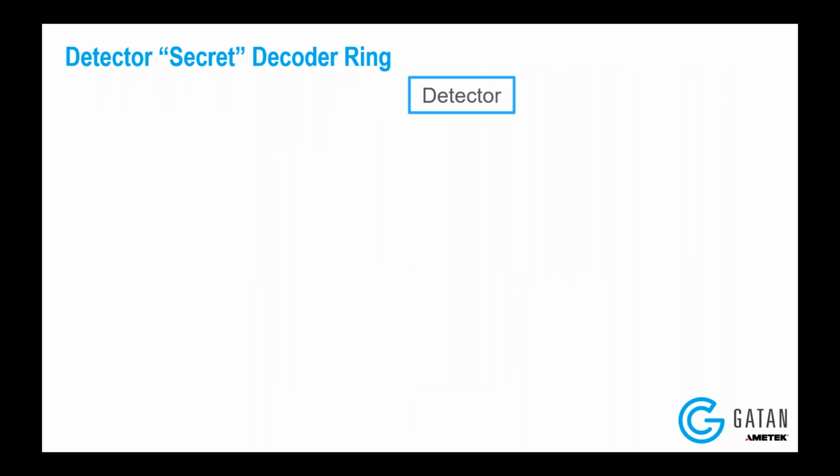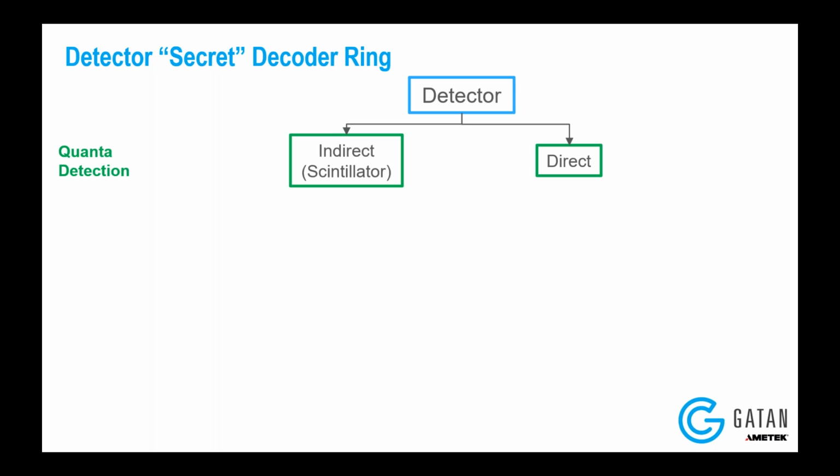But as I already just walked us through the Gatan imaging portfolio, I think there's a lot of terms that we use for describing the different cameras that many people may not be familiar with. So I thought it'd be useful to walk through all the different ways that we can describe a camera and how the design attributes of a camera that you use for electron microscopy can impact its suitability for different applications, different beam intensities, and different kinds of experiments.